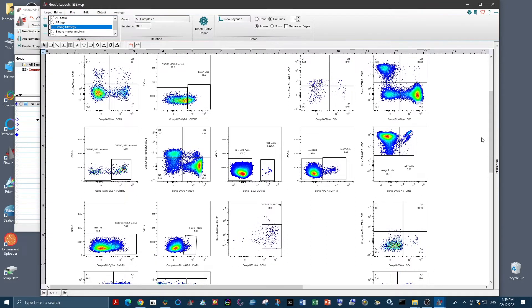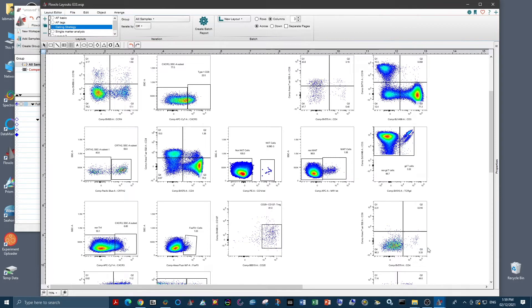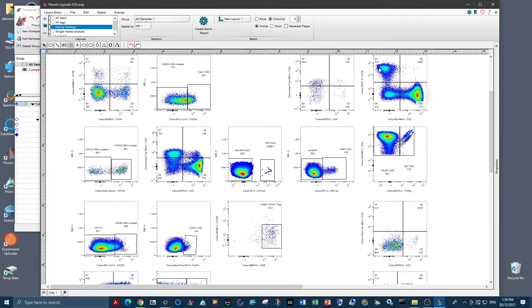And you just want to keep an eye out for any unexpected combinations that could crop up and show unmixing error or something wrong with your data. For example, this panel was run on PBMCs. So looking at the CD3 versus CD19 plot, we would of course expect to see some CD3 positive T cells, some CD19 positive B cells, but we wouldn't expect to see any double positive cells, which is great. We don't see that here.